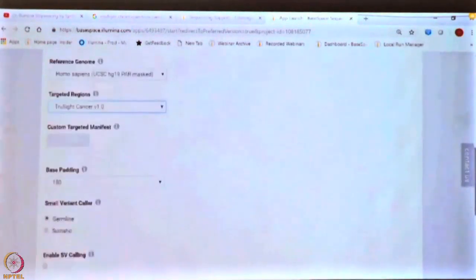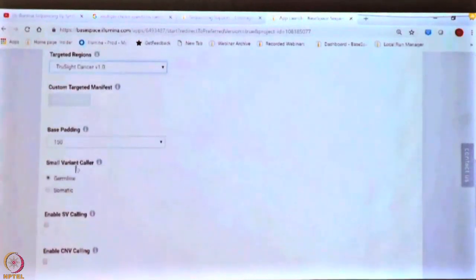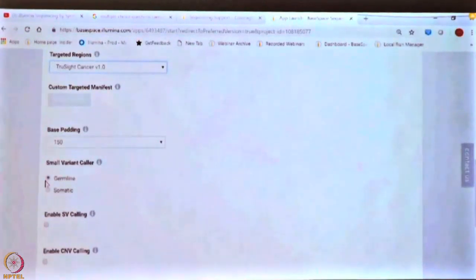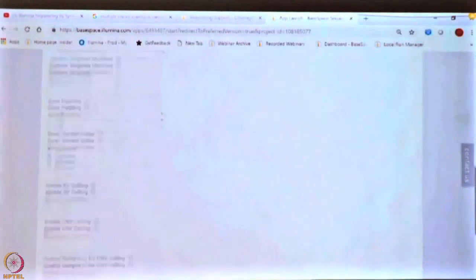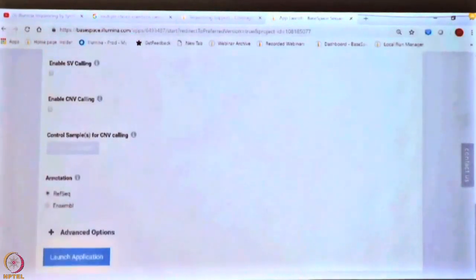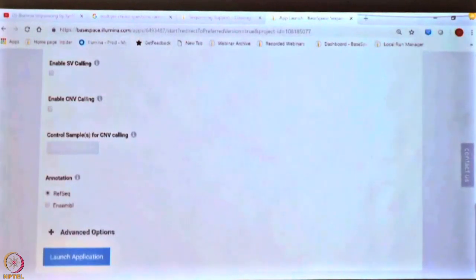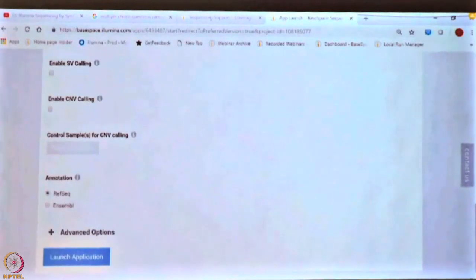If you continue scrolling down, you will see other options, for example whether this is for germline or somatic variant calling. The TruSight Cancer panel is meant for germline variant detection, so that is what I will select. We are going to leave all the other parameters as default. There are many options because most algorithms come with multiple options to tweak the analysis. We recommend that new and basic users use the default analysis, and as you become more comfortable with the data you can play around with the parameter options.